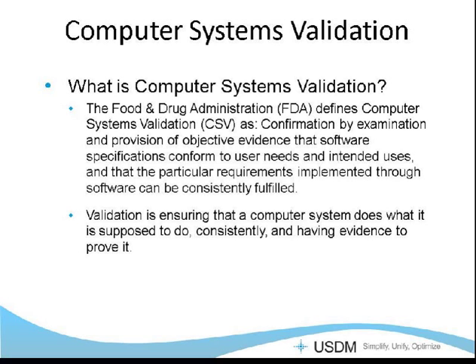So what I want to start with is talking a bit about what computer systems validation is, a little bit about the regulations, and how they apply in laboratory situations. How can we apply a risk-based validation approach to legacy systems in the lab, to new systems in the lab, to LIMS systems? So let's get started with what is computer systems validation anyway? The FDA definition is on this slide, but at the end of the day, validation is confirmation that your computer system does what you want it to do, what you need it to do to meet your day-to-day business use.